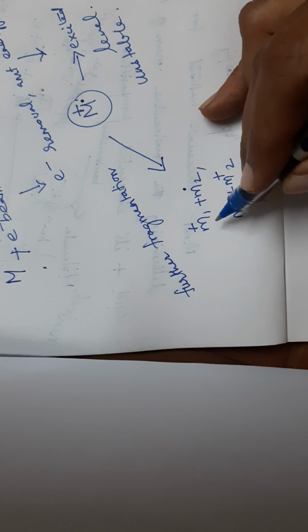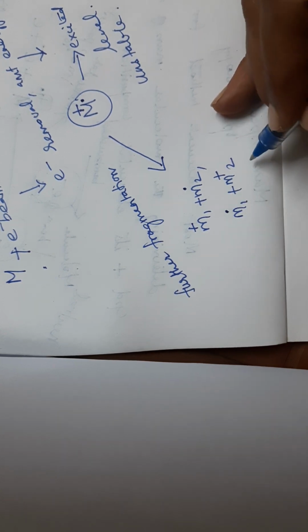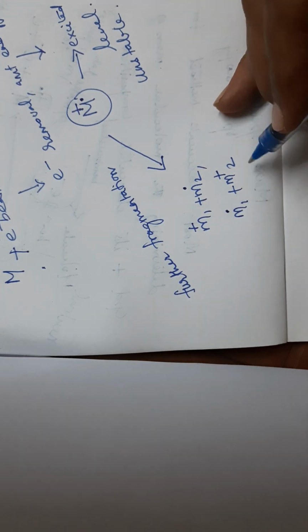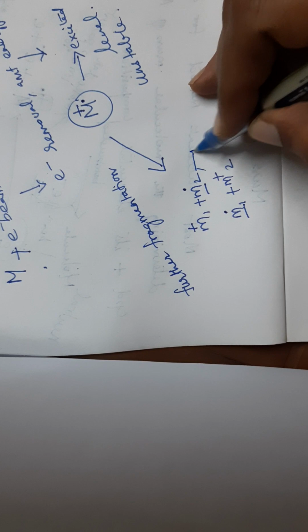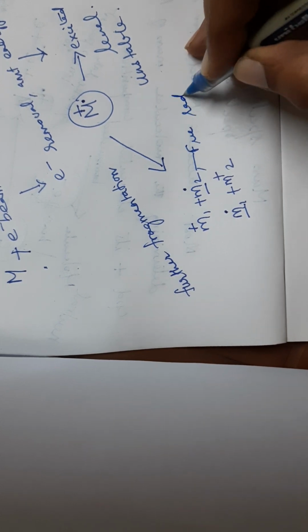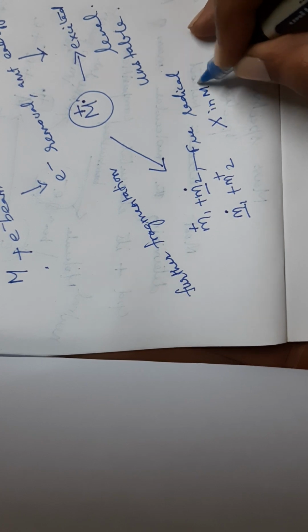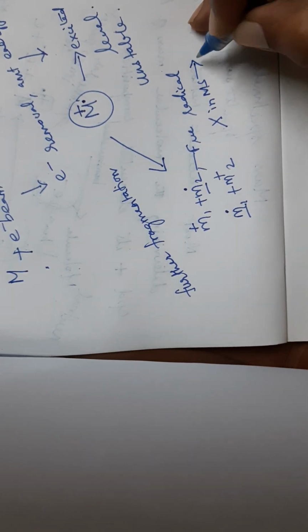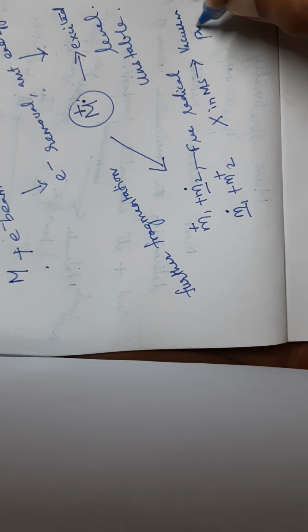So the mass to charge ratio for M1 and M2 will be the molecular mass of M1 and M2. These free radicals are not detected in mass spectrometry; they are removed by the vacuum pump.